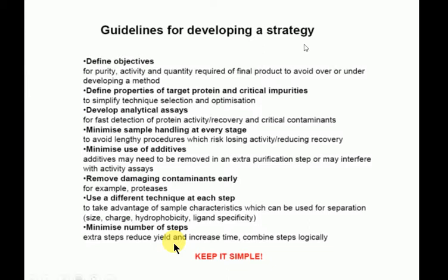Okay, so you need to develop an assay, and that's going to influence you. Are you looking for a function? So are you following the purification of an enzyme? If so, the assay is obviously your enzyme assay. But quite often you'll be purifying a protein that isn't an enzyme.